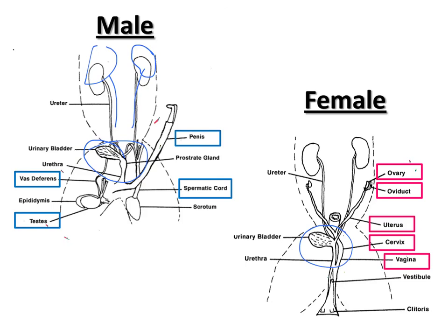In a mink, it's not going to be full, so it's not going to be stretched out. It's going to be this little small, dense organ, it's really not hard to find in there. And then from the bladder, you can exit again via the urethra in either of these cases. Okay, so that takes care of the digestive system and the urogenital system, which will be the next part of our dissection.